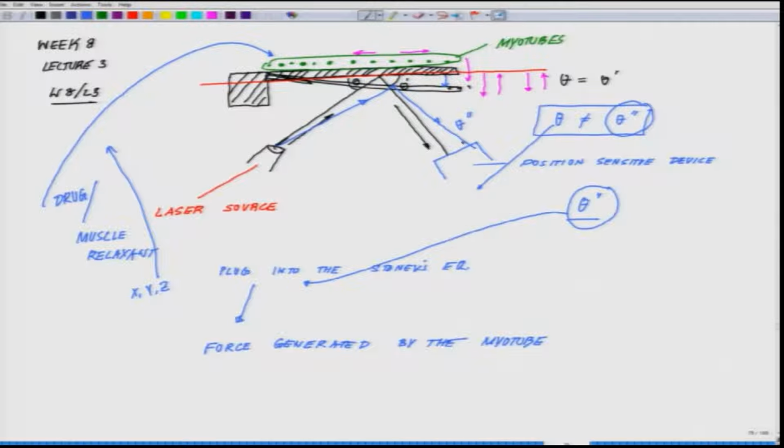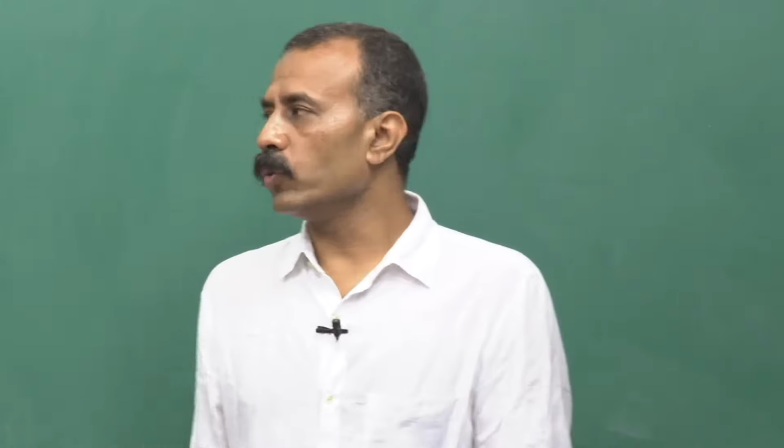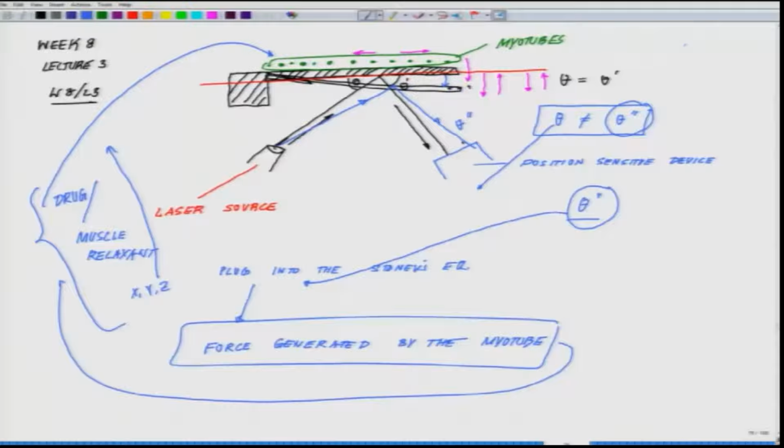Upon adding, if you see the change in the force generated by the myotube, then in a very clean in vitro system you will be able to predict how a specific drug is going to behave in a system like this.